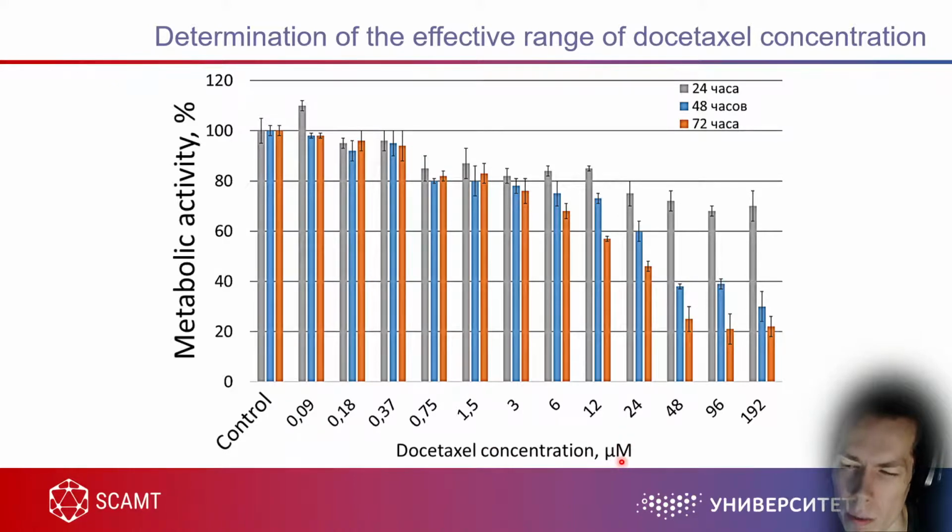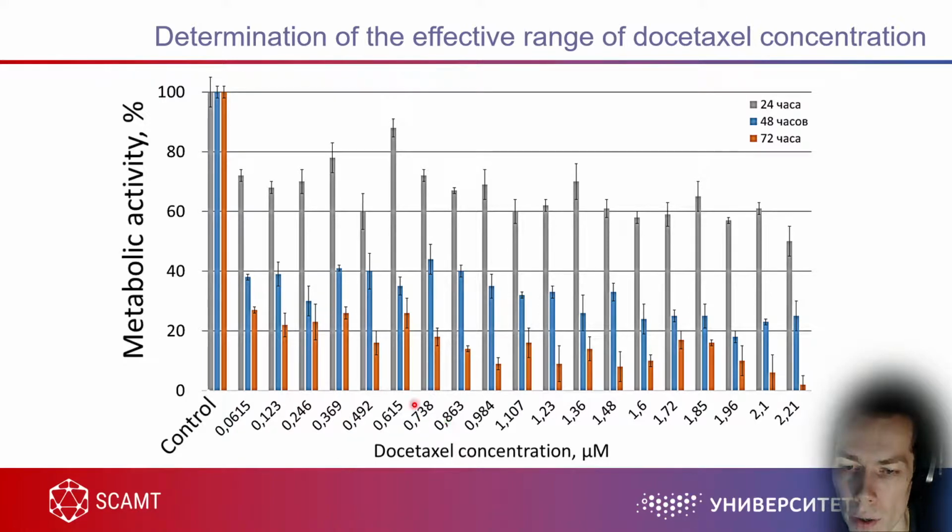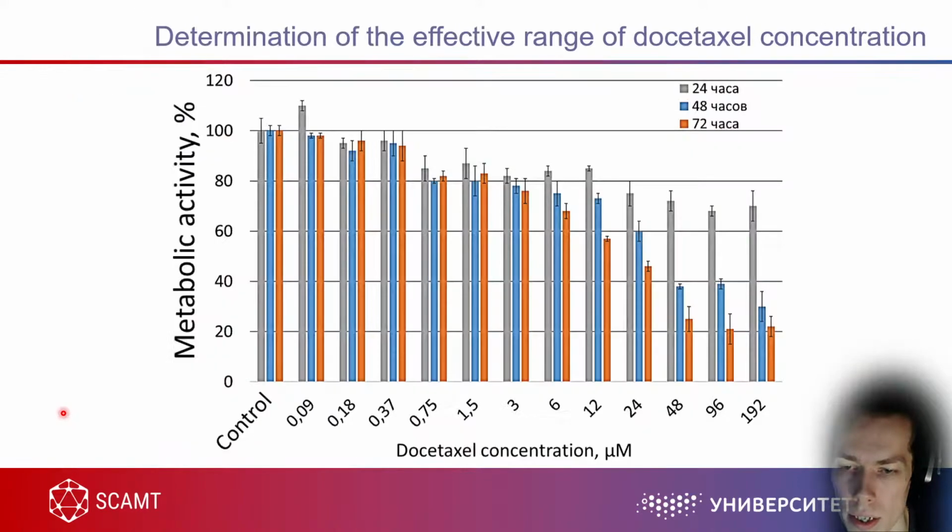Well, it's not a micromole, it should be a nanomole here. So it's a dilution of the drug from this point down to nanomole, and this is not even a nanomole, it's already picomole concentration. And you can observe here that at some concentration, even after 72 hours, there is no cytotoxicity observed. What we aim to find here is a somewhat exponentially looking decrease in cell viability.